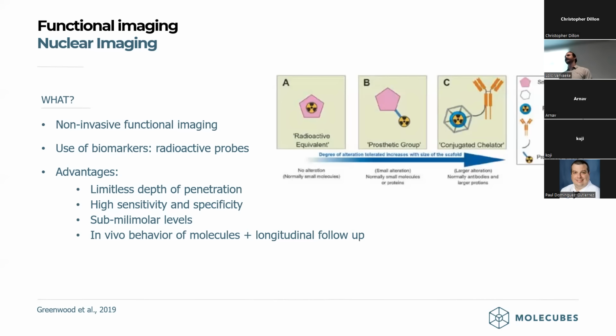If you then inject this tracer, as it is called, inside an animal, the FDG gets metabolized, but the little isotope that's bound to this sugar will still emit gamma rays, which are then captured by the PET camera. And it's this way that you can really image the entire processes inside of animals. FDG or F18 FDG is just one of the many different configurations that you have between different isotopes and different ligands. You can hang isotopes on antibodies, on different sugars, on specific monoclonal antibodies. There's a whole range of those.